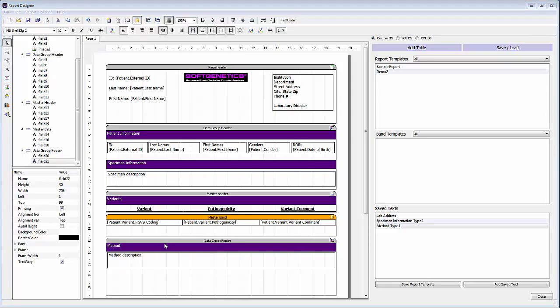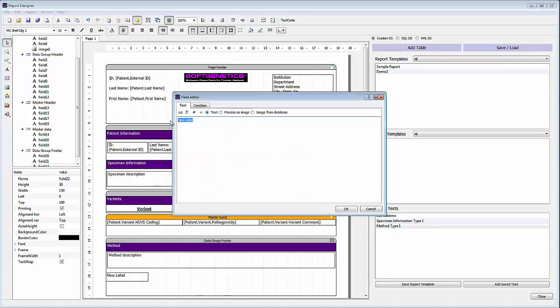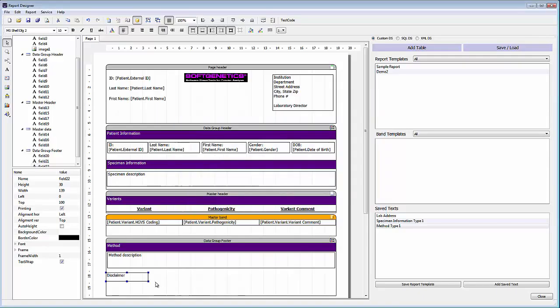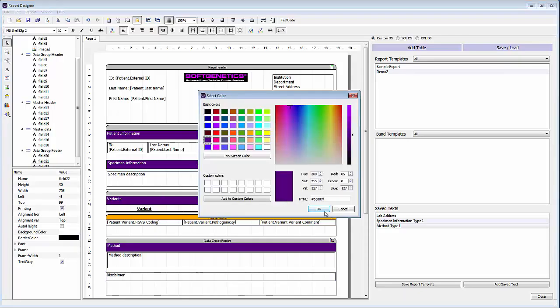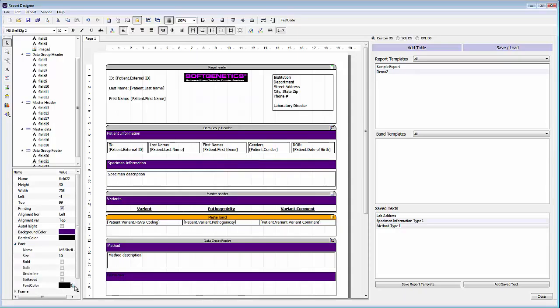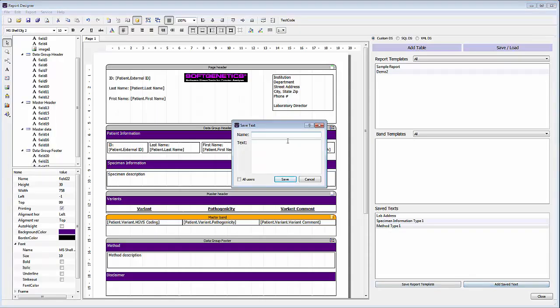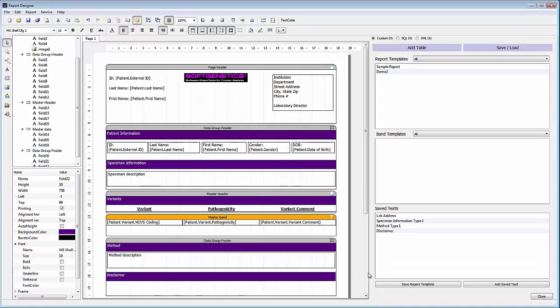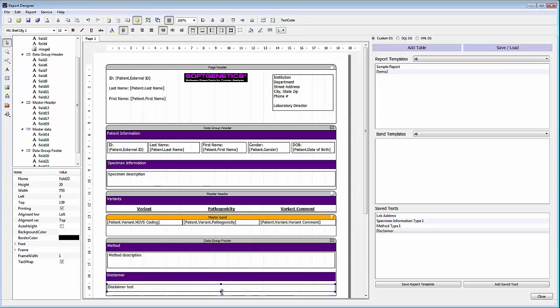Then we can add one more section to our report. We'll create another new label for this new section and make this section for a disclaimer. We'll format this section header — changing the background color to purple and the font color to white. We'll use the saved text option again, so we'll go to add saved text, name it disclaimer, enter in your text to be used as a disclaimer, and save that. We can then click and drag to add this to the report template and resize to make sure all the text will be displayed.